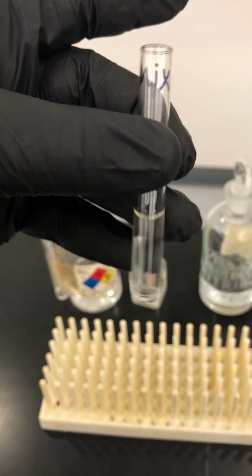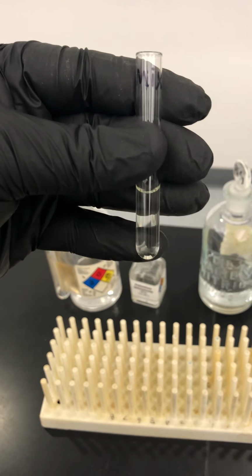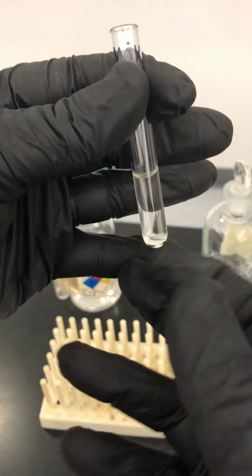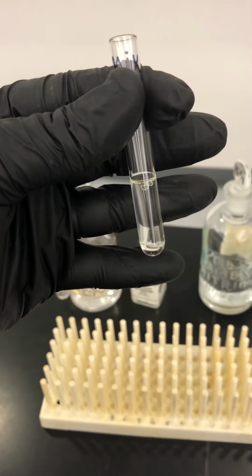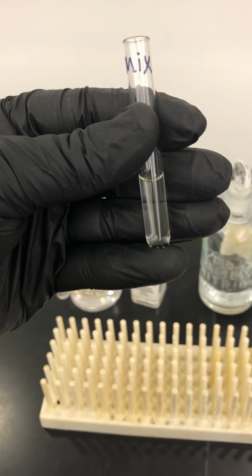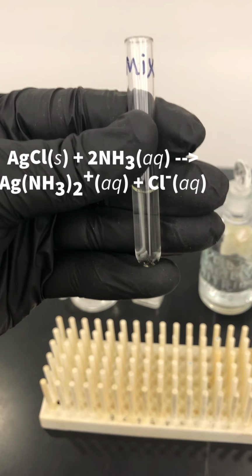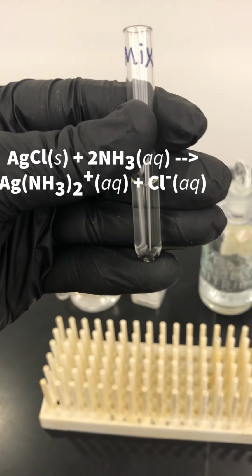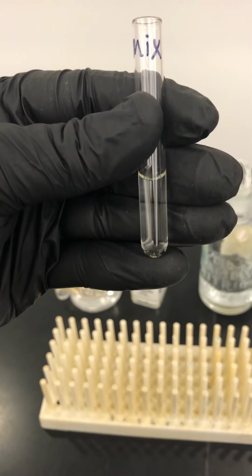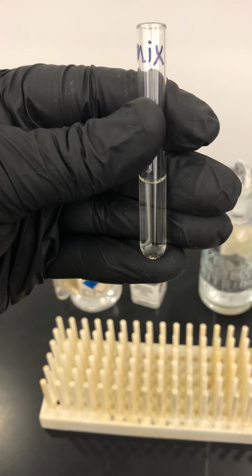Okay, students, remember we had a mix from our first step, which contained a silver chloride precipitate. I resuspended it and added 6 molar ammonia. And here is what you get as a result: the pellet has dissolved. Later on in the semester, we'll learn why this is. The reason is that silver ions form what's called a complex ion with ammonia that makes it more soluble in solution. It displaces the silver ions from the silver chloride precipitate and puts them back into solution in the form of a silver ammonia complex.